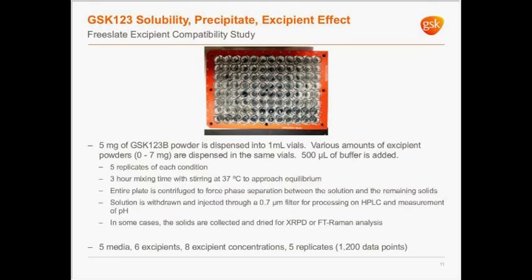This time and temperature were selected to closely resemble the stomach retention time of an ingested tablet at body temperature. The 96 well plate was centrifuged to force phase separation between the saturated solution and the excess solids that remain in the bottom of the vials. And then following a filtering process, the solutions were placed on an Agilent 1100 series HPLC, and we measured them for solubility. The solids that remained in the vials were then dried and sent out for Raman analysis.